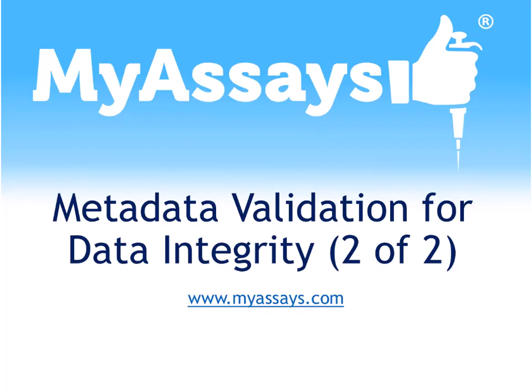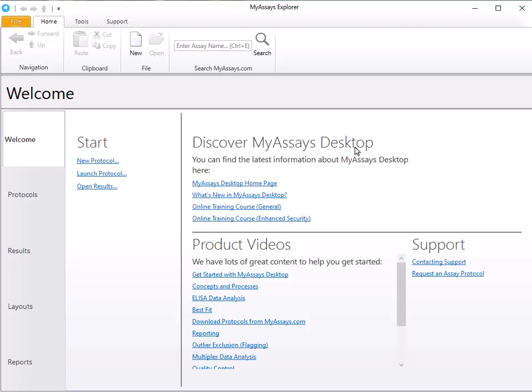This is the second video in a series. In the first video, we demonstrated how the process works, and in this video, we'll cover how to configure the protocol to perform metadata validation. First, let's create a new protocol configured to import this type of measurement data and metadata.